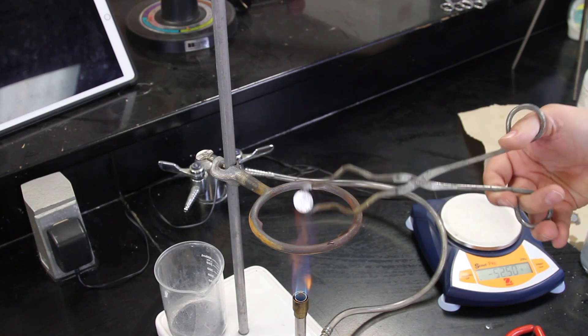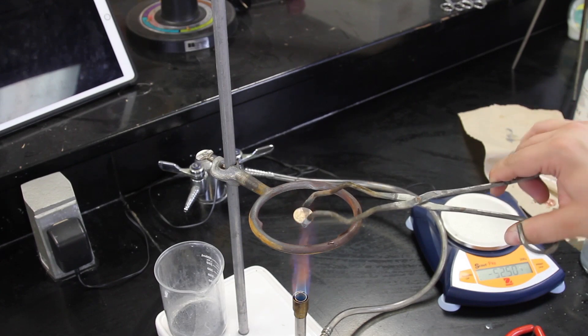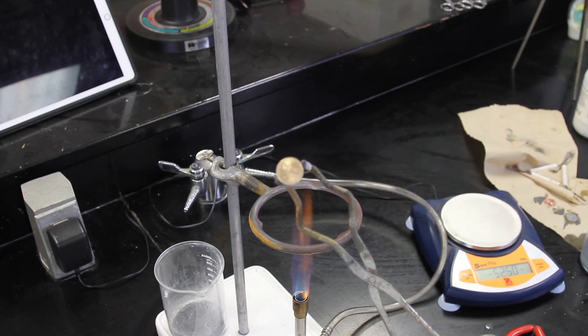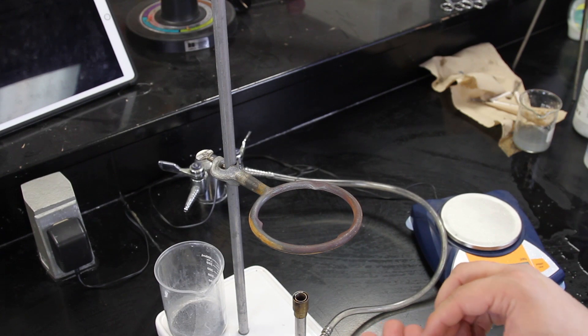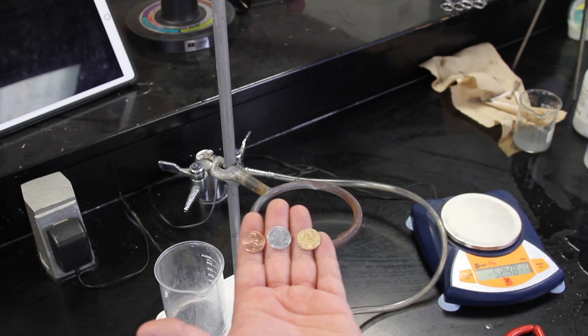Take care not to overheat or the brass will discolor. Allow the coin to cool on a heat-resistant surface. You can now compare the three coins: copper, silver, and gold.